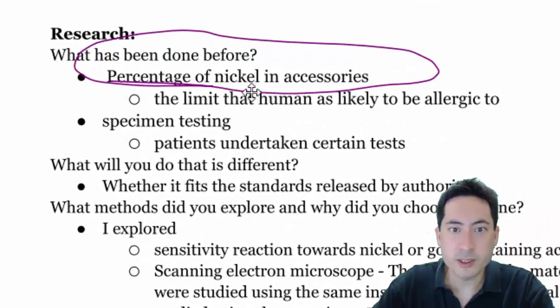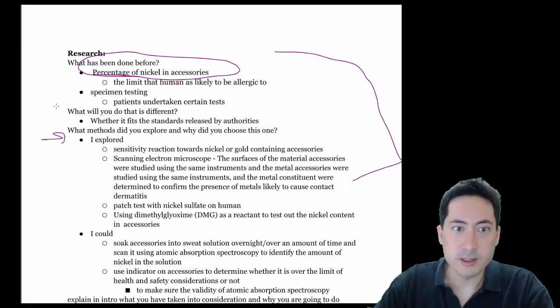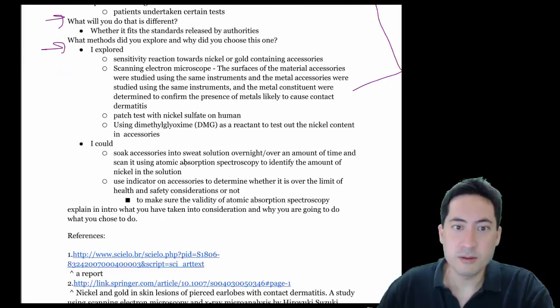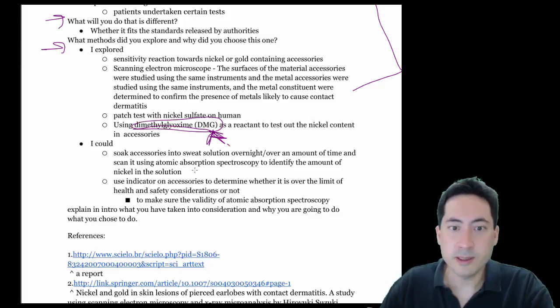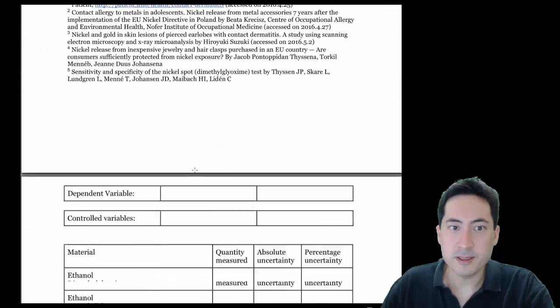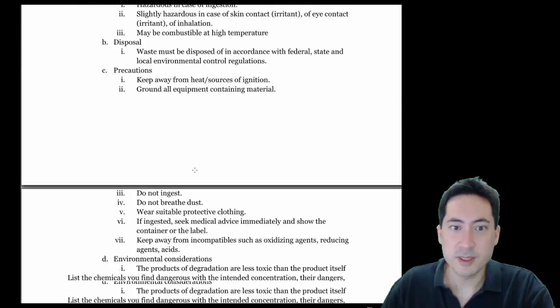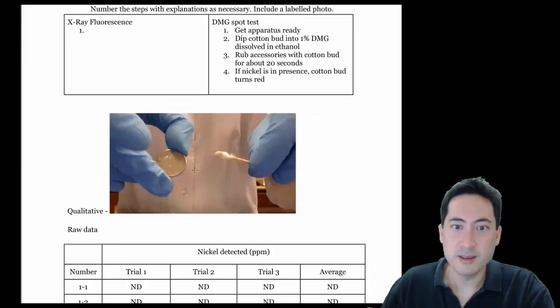Now I've put a few questions here. This needs to kind of get cleaned up. These are sort of leading questions to try and get a good method. Now I saw this student actually make up this reagent. They bought this themselves and they got it to work quite well, and I saw the results in class, but I don't see this.